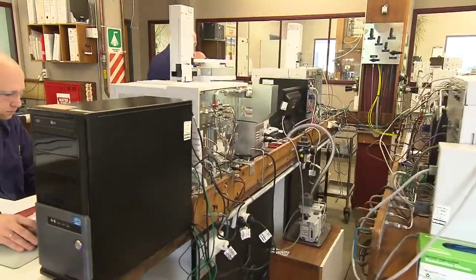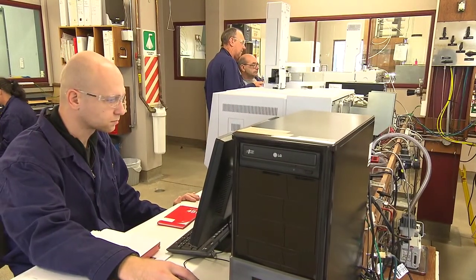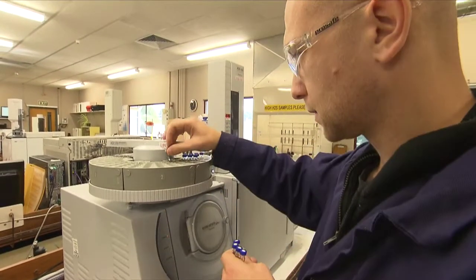This area uses specialist technology to identify and quantify individual compounds and elements within fuel and hydrocarbon mixtures, as well as routine water testing. Techniques such as GC, GCMS, ICP and FTIR are used for both routine and problem-solving analysis. The GCMS is a valuable troubleshooting tool for identification of unknown contaminants and is used to carry out hydrocarbon fingerprinting. Other GC applications can be used to determine boiling point distributions.